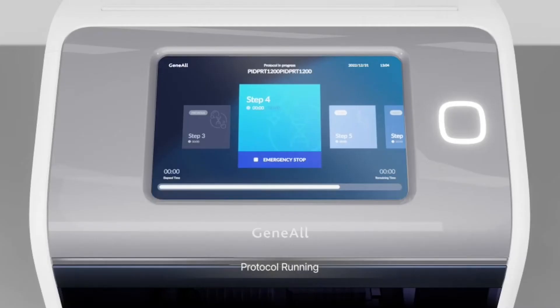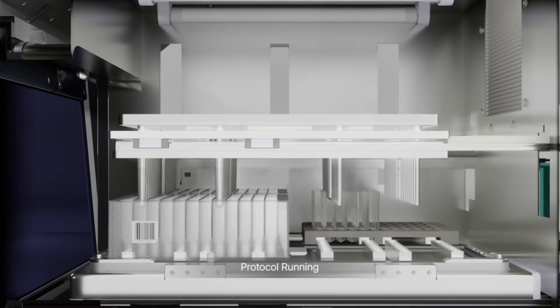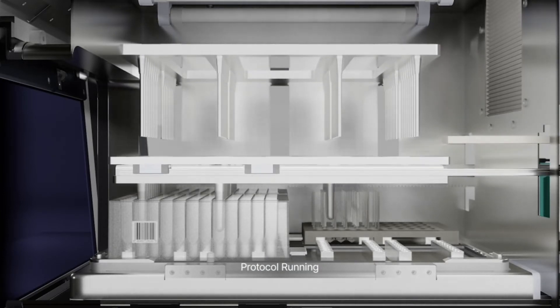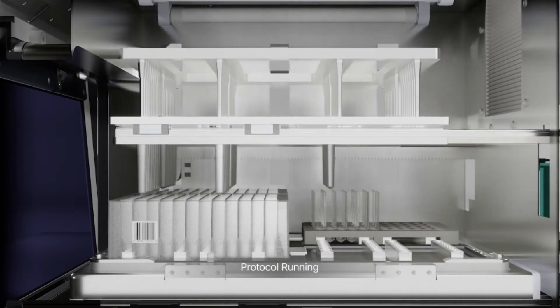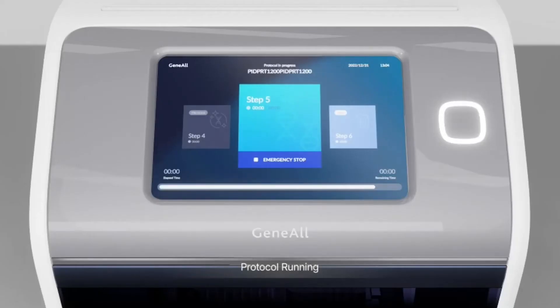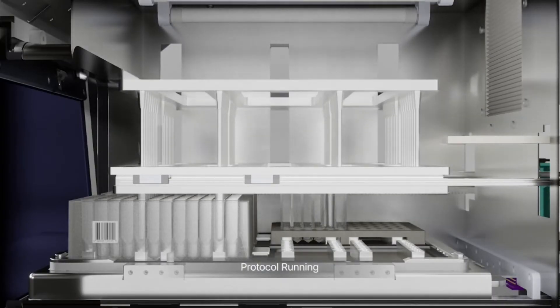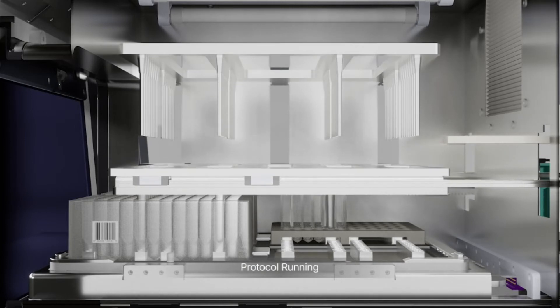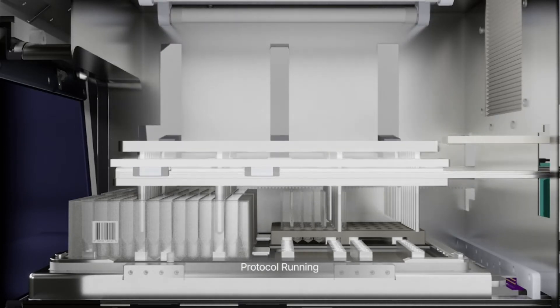This results in not only scalable extraction maintaining the small footprint and compact design of existing low throughput instruments, but also long-term stability, meaning users can enjoy continuous consistent performance without frequent calibration.